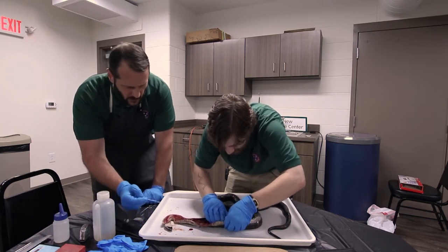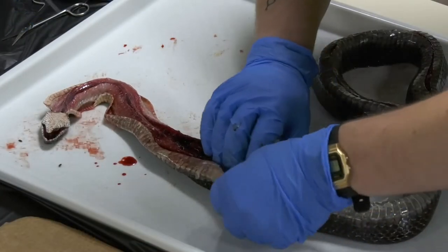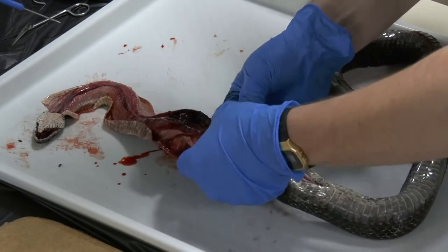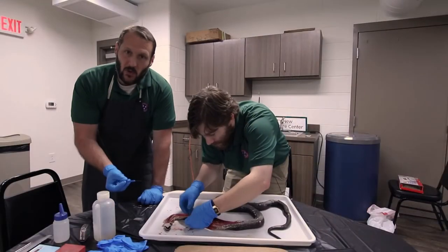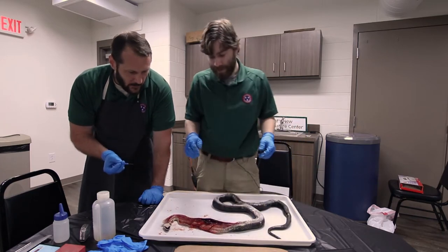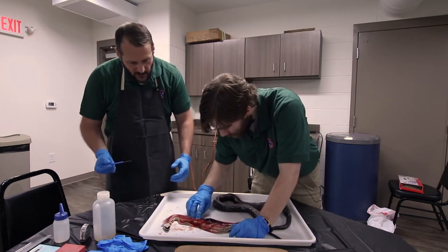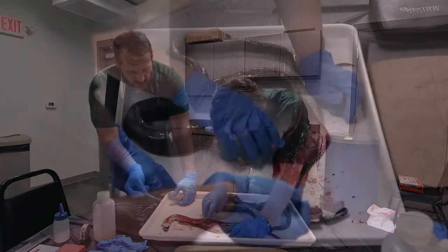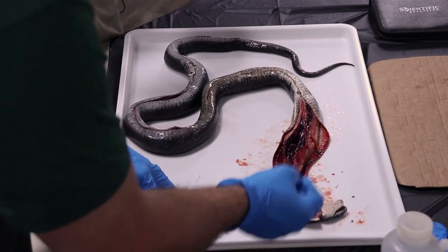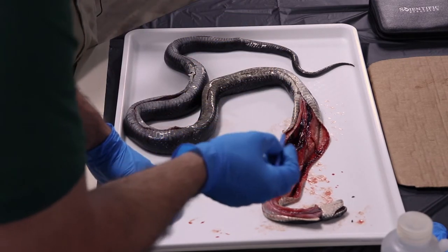As we identify the internal systems of a snake, you really get a sense of how they're put together in terms of where is their neck, where is their body, where is their tail. If we were looking at our pet dog or cat or pretty much any critter on the planet, you can identify those structures right away, because you have external landmarks, arms and legs and ears that help you identify those body sections. On a snake, they don't have external ears. They don't have external arms and legs. But they still have the same major body segments that other animals and especially other vertebrates have.